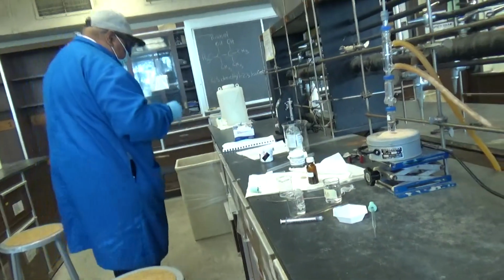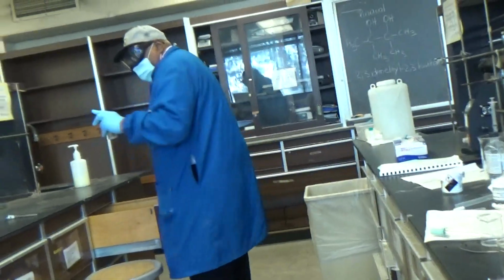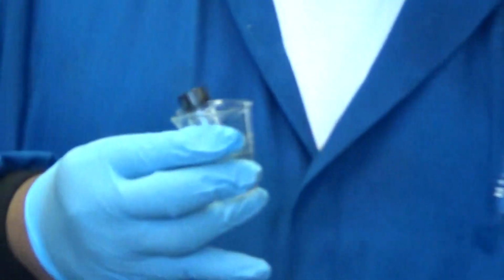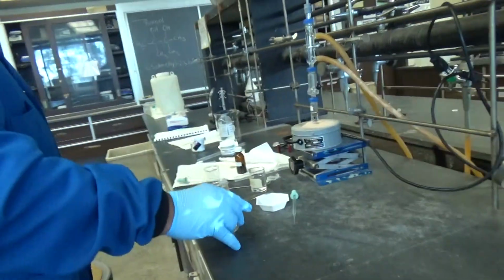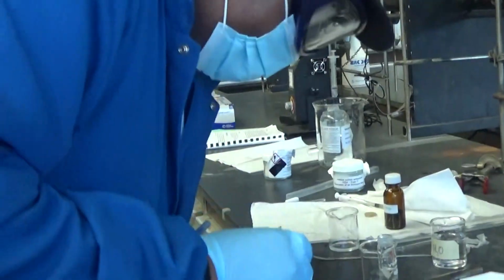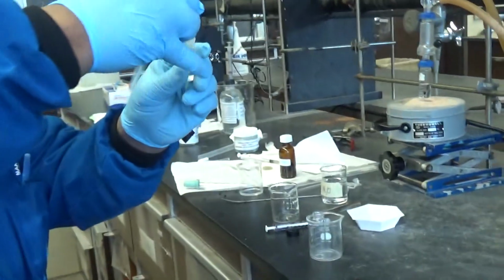Now I will do the same. I need to put that into a small beaker. Get a fresh beaker to hold it up so it doesn't fall. That's just to avoid technical mistakes. Good idea. Okay. So at this time you need the different Pasteur pipettes. The clean one, and open that.